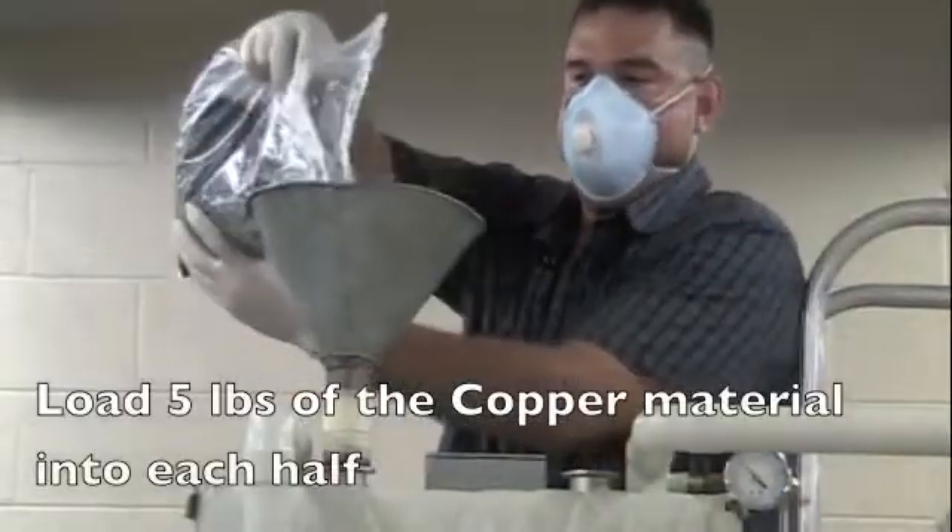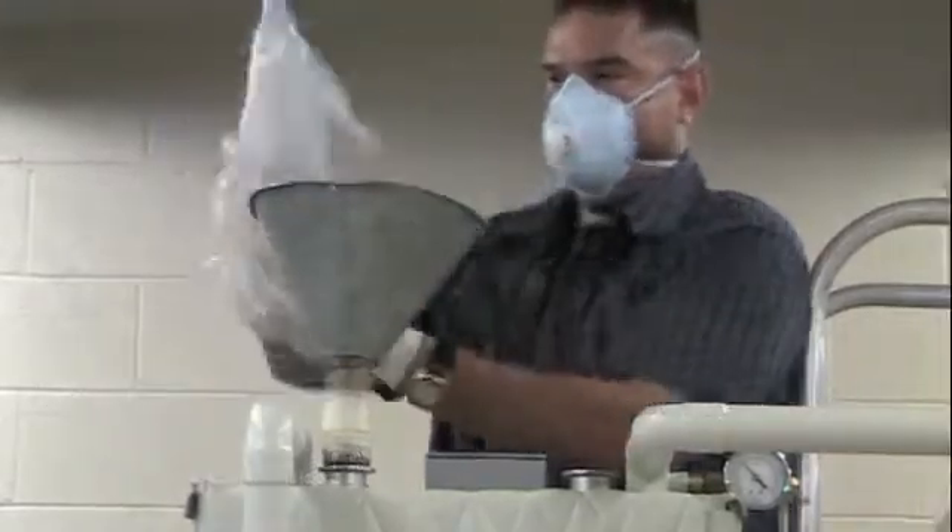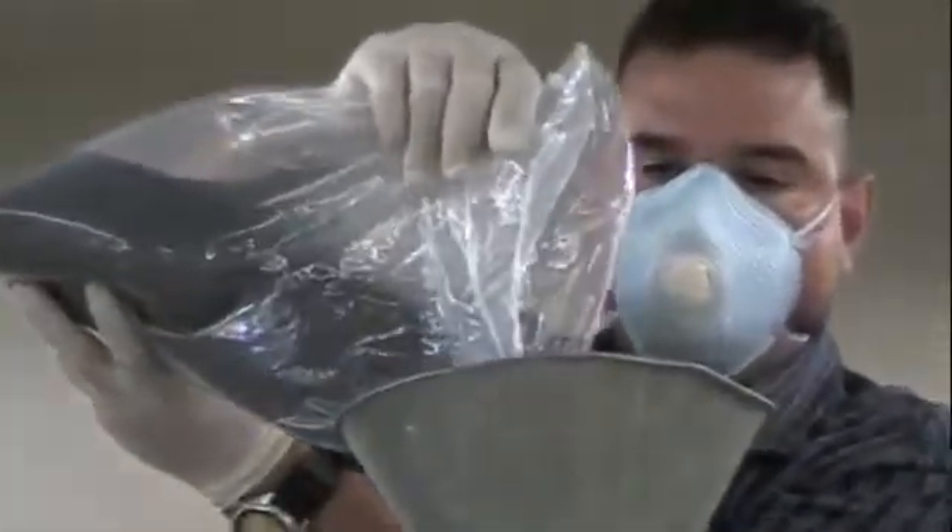Next, load 5 pounds of the copper catalyst to both halves of the purifier. Load 5 pounds of the copper catalyst to the second half of the purifier.